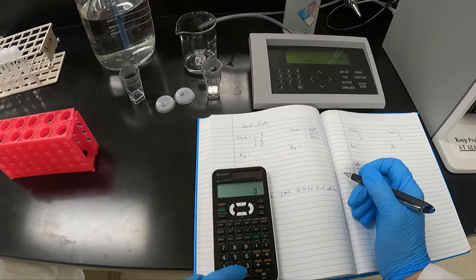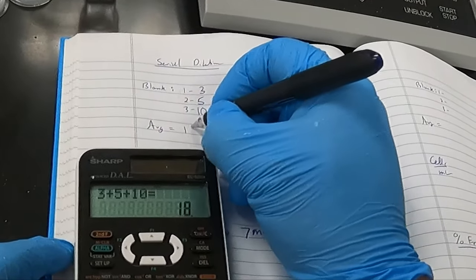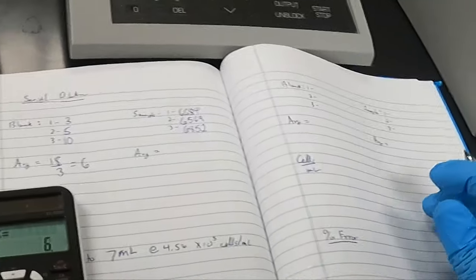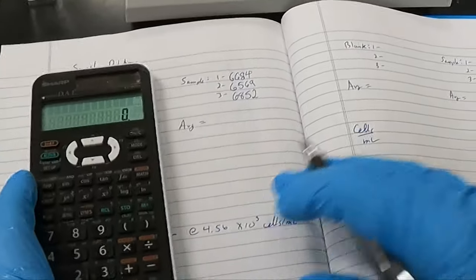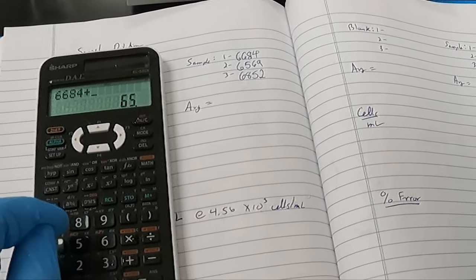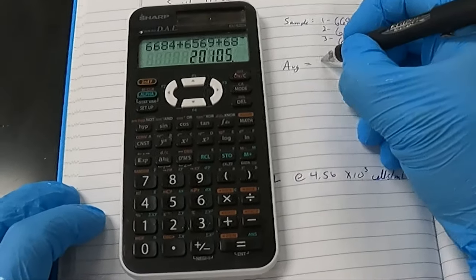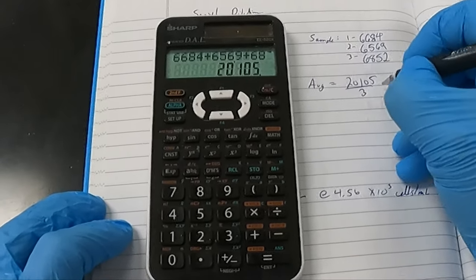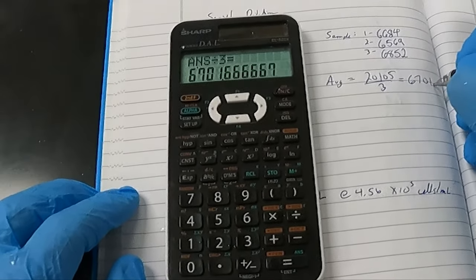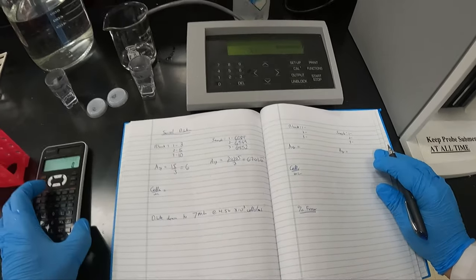Let's now do our calculations. Let's do our average blank. 3 plus 5 plus 10 is 18. 18 divided by 3 is 6. Now our average sample. 6684 plus 6569 plus 6852. 20,105 divided by 3, 6,701.66666. Please do not round off until the final answer.